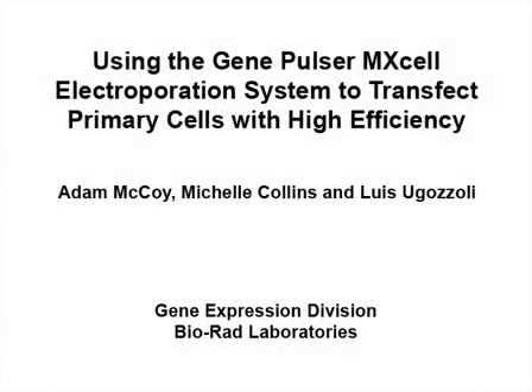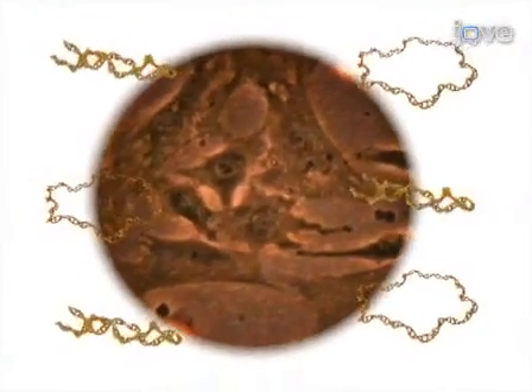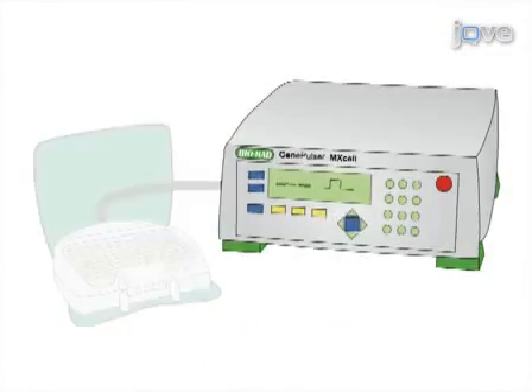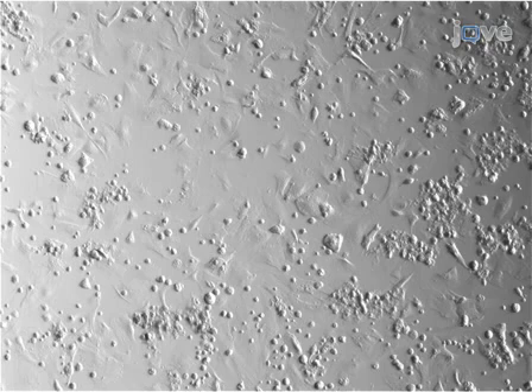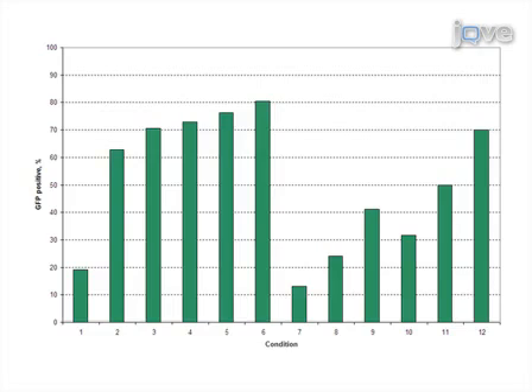The overall goal of this protocol is to identify the optimum electroporation conditions for transfecting primary cell lines, using mouse embryonic fibroblasts, or MEFs, as an example. MEF cells and nucleic acid of choice are loaded into a 96-well electroporation plate attached to the GenePulsar MX cell system, which allows for the testing of multiple electroporation conditions in a single run for optimization experiments. Cells are cultured post-electroporation and analyzed for transfection efficiency using epifluorescent microscopy and flow cytometry. The most efficient electroporation conditions can then be selected for future transfections.